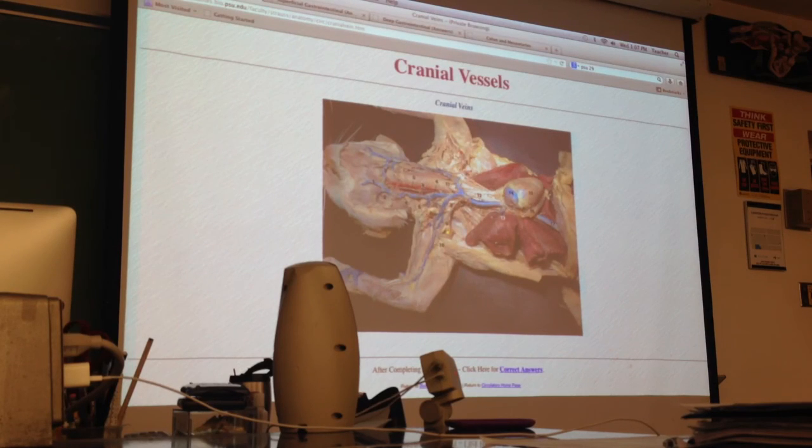If we pin the brown, we'll be asking for the cartilage, but if you're unsure what we're looking at, we're going to try to specify in the question ID space, so that you understand that we're asking for the trachea, versus ID structure. The only reason we'd make that distinction is because, as you'll see, it's really hard, especially on an exam, if you're looking at a really thin pin going through a really thin structure, to tell the difference between whether it's in the brown or in the white. Any other questions?